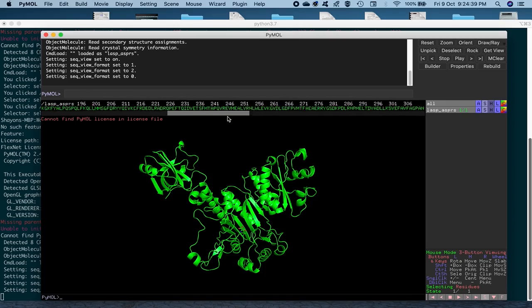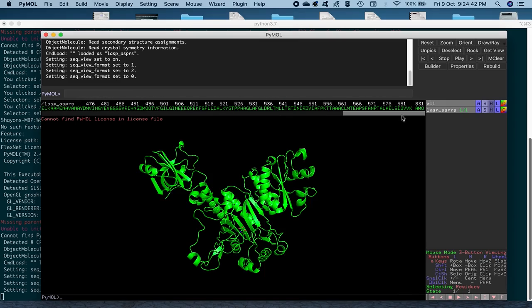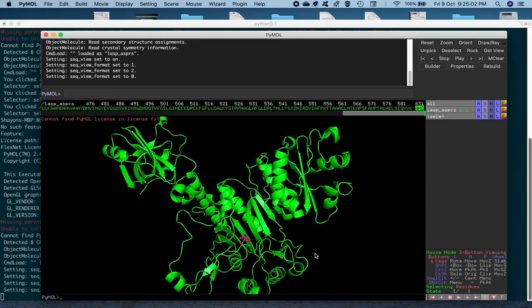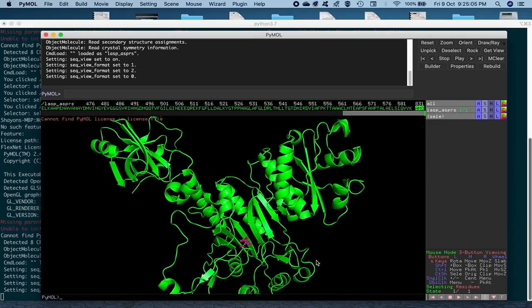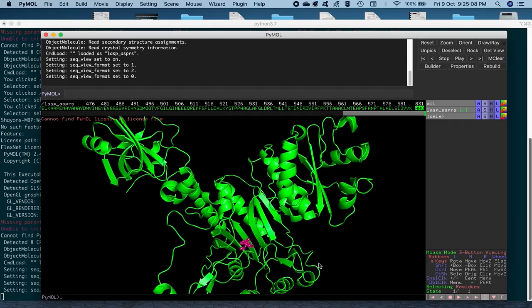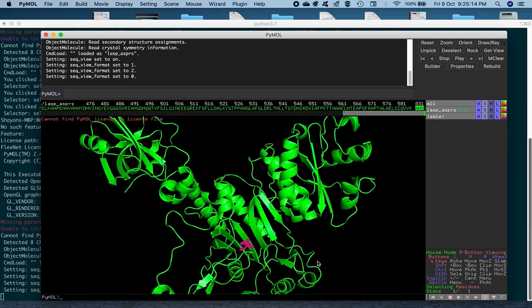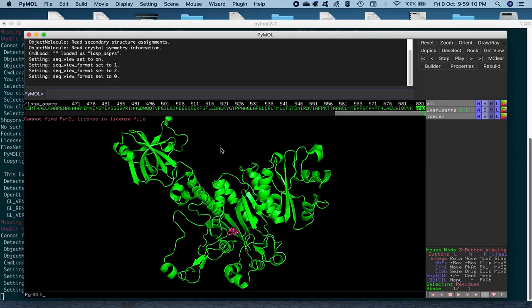And what we're interested in is first changing the residue name AMO to ASP, which we can do by highlighting it first. So you click once on it and the residue here will be selected. Another thing is, if you want to zoom in and zoom out in PyMol, you've got to press the right button on your mouse, and then drag along. If you drag further down, then it will zoom out, and if you drag closer to yourself, it will zoom in further. PyMol has a command line interface as well, just like the VMD scripting language and Chimera's command line interface.